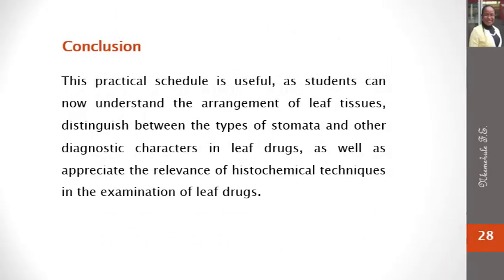In conclusion, this practical schedule is useful as students can now understand the arrangement of leaf tissues, distinguish between the types of stomata and other diagnostic characters in leaf drugs, as well as appreciate the relevance of histochemical techniques in the examination of leaf drugs.